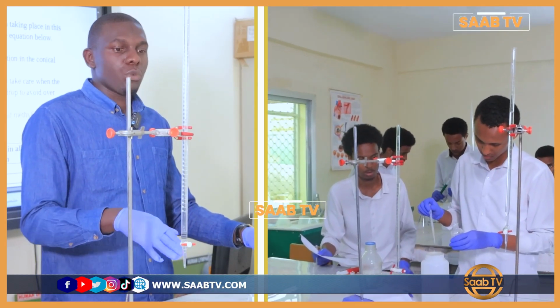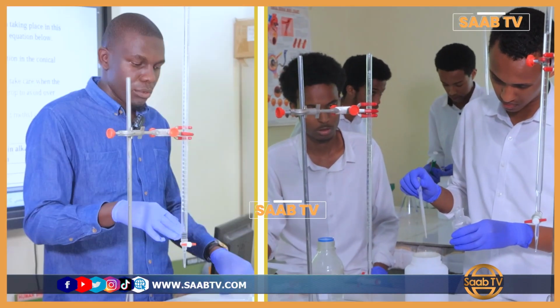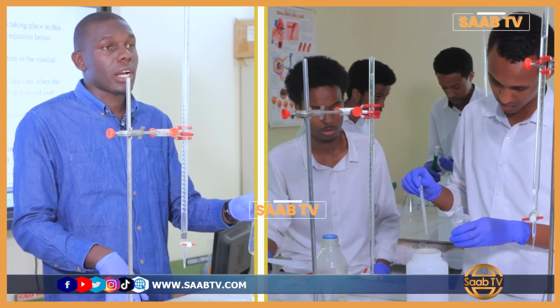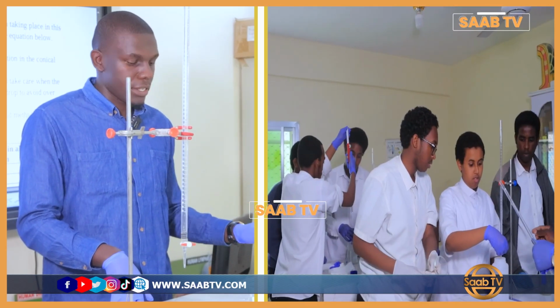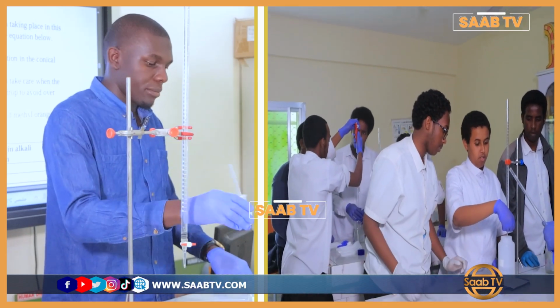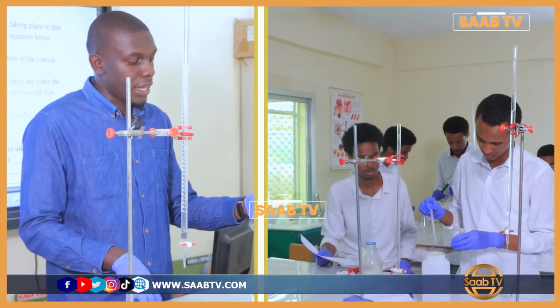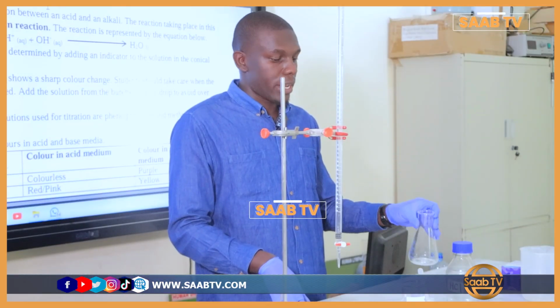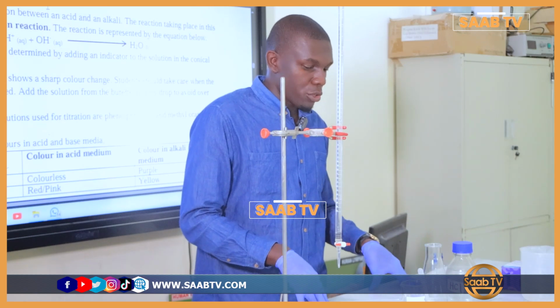Then after that, we shall run the acid into the sodium hydroxide in the conical flask until the color of the indicator turns colorless. Our indicator we are going to use today will be phenolphthalein indicator. So towards the end point, we need to add the acid drop by drop such that we don't add in excess or more than what is required. So that is what we are going to demonstrate.